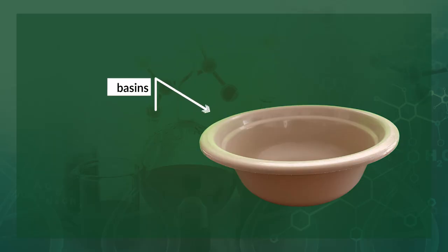What else? You also need basins. Now, we have 4 liquid samples. If you have lots of basins, you can use 4 basins. But if you have limited basins, you can just use 1. Just make sure that you dry and clean them before using them for another sample.